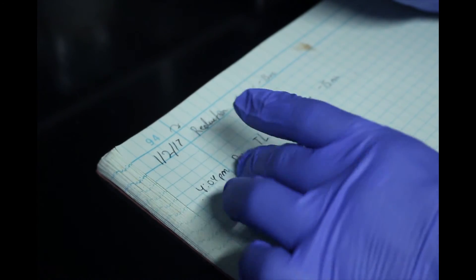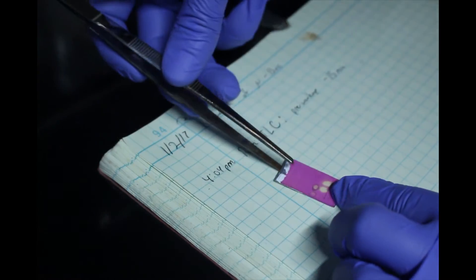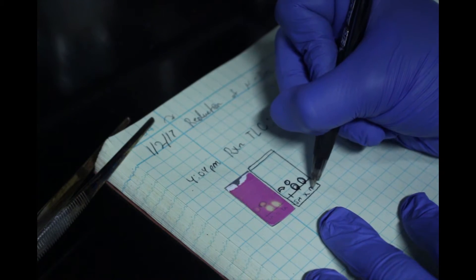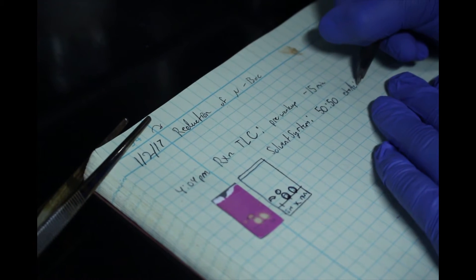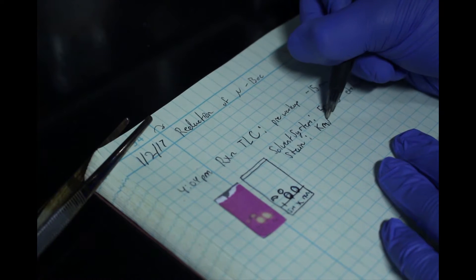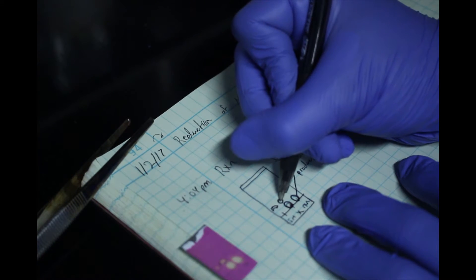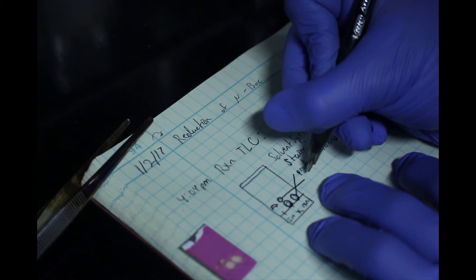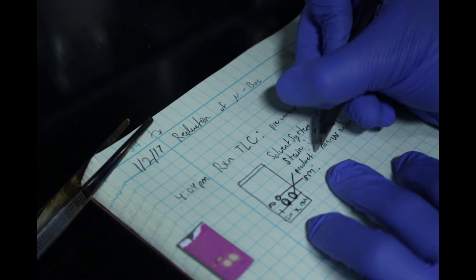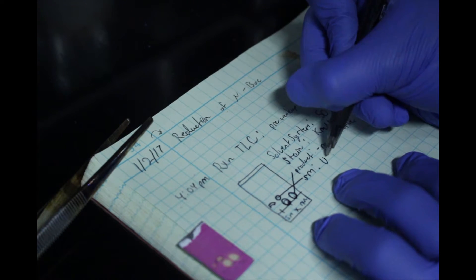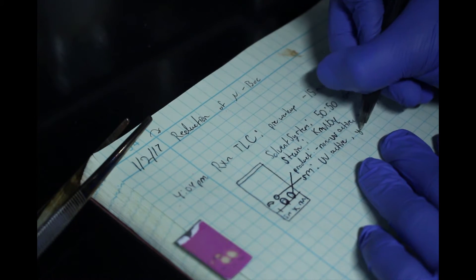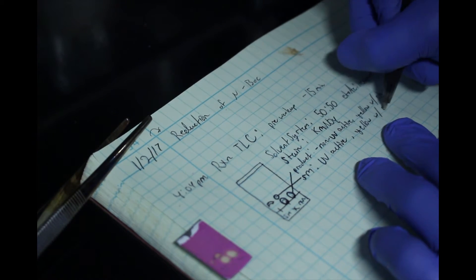When recording TLC information in your notebook, be sure to identify the following: A traced drawing of the TLC plate. Solvent system that achieves an ideal separation. TLC stain. Each spot should be labeled with what compound it is, starting material, product, unknown, etc., whether or not it is UV active, and the color the spot turned using your stain. If monitoring the progress of a reaction, indicate the time TLC was performed.